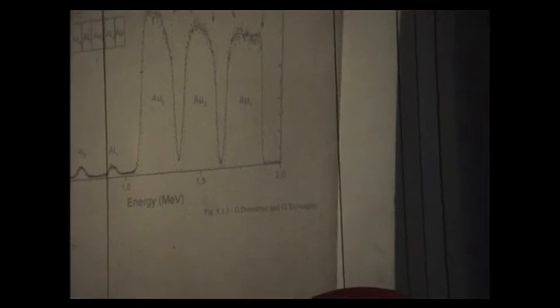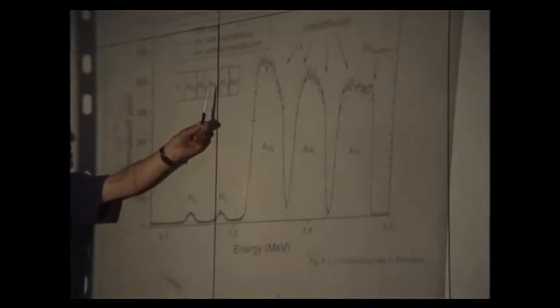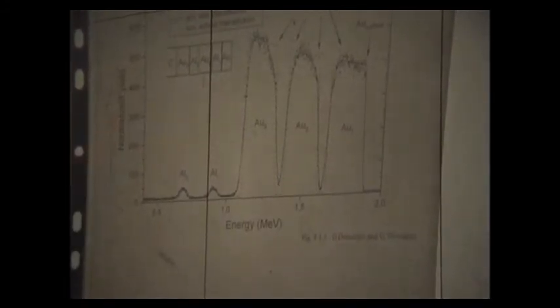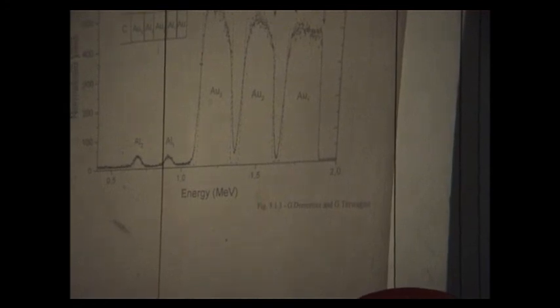One technique to analyze material is Rutherford backscattering. I will give only one example here. It was a succession of coatings of gold, aluminium, gold, and so on. When some incident particle interacts with gold, it is like a pea, a small pea interacting with some elephant.